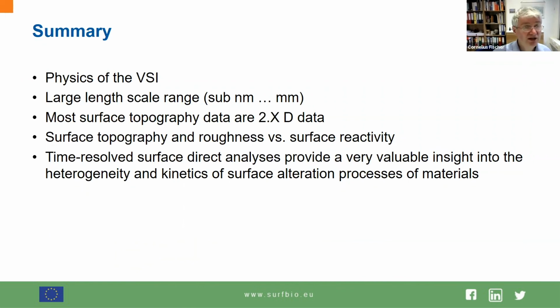So I hope I have been able to provide you at least the basic physics of VSI. I hope to explain some constraints of practical use, with the large length scale range and very high resolution. We discussed the critical importance of really understanding what's going on with this kind of data set, since it's not tomographic data.